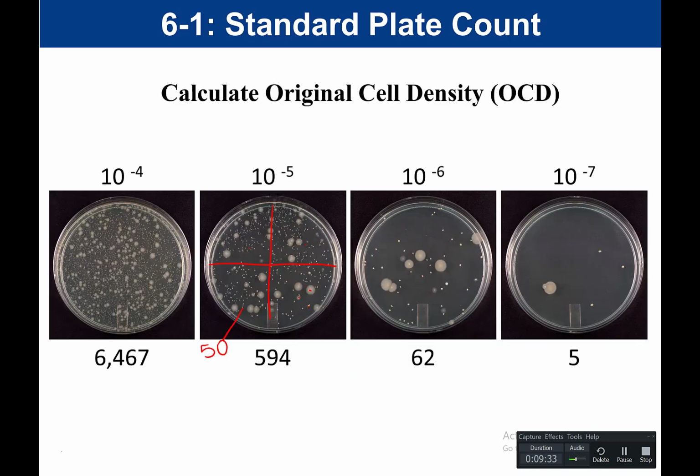If given a set of pictures of plates that would be found in a standard plate count, and given the number of colonies like is shown here, you should be able to calculate the original cell density. Again, this is something that we reviewed during the Zoom session.